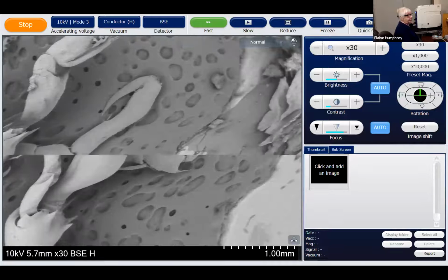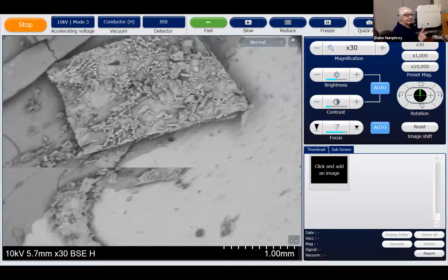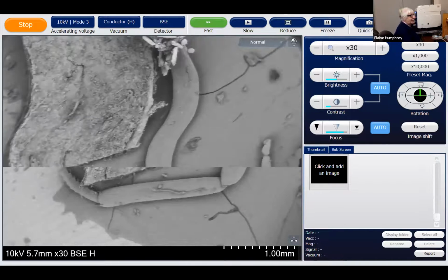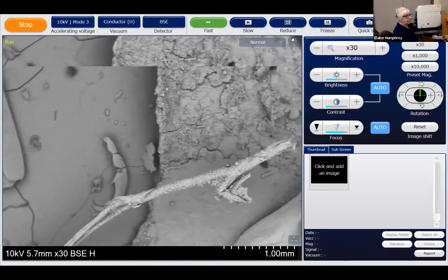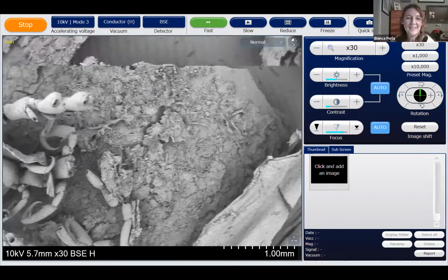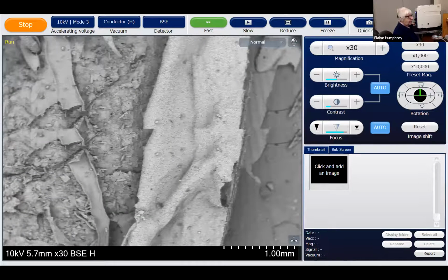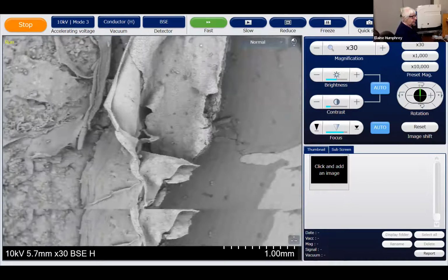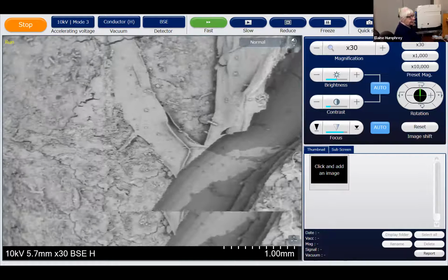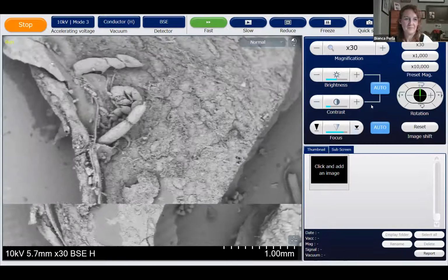So if we go back, we'll go back to our, I'm not getting sidetracked by stopping on the way, because every time we get sidetracked, we find something new. So Elaine, the skeleton shrimp you could see with your naked eye. Yes, but the baby one would be difficult to see. I've lost him. Hold on a second. He's right by the Toblerones. Here we go. There. So he's very tiny.